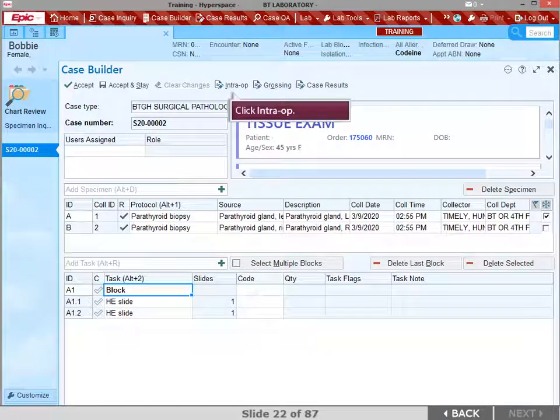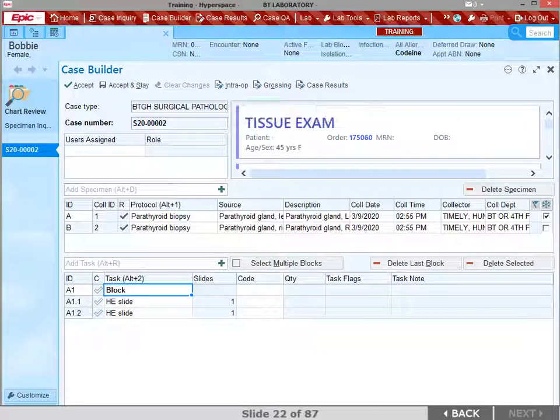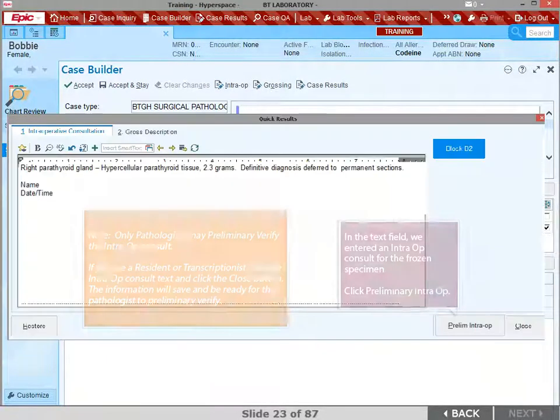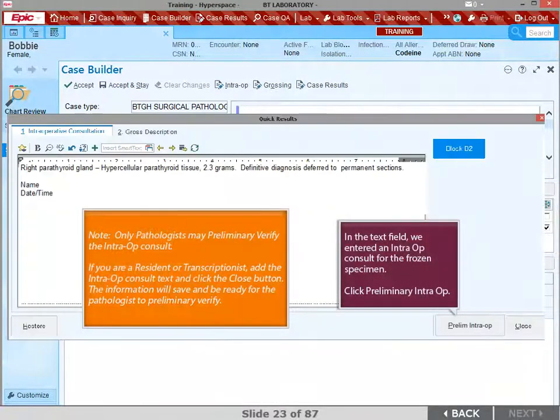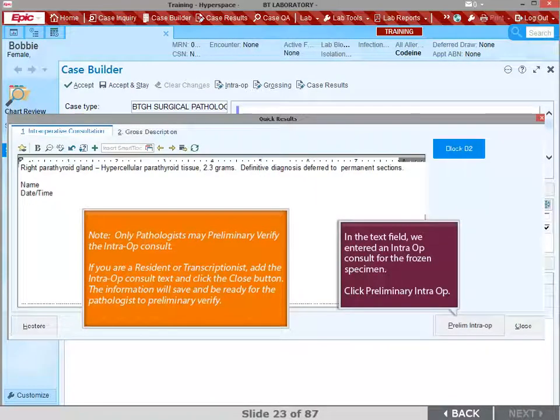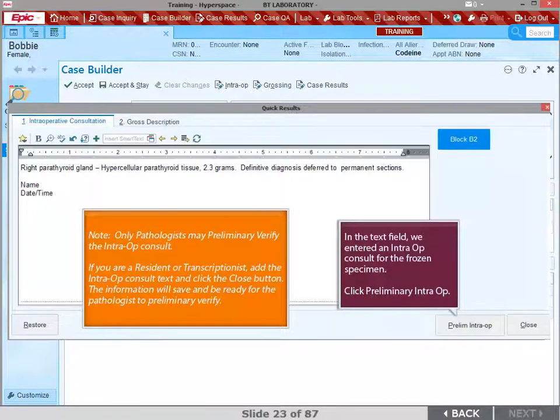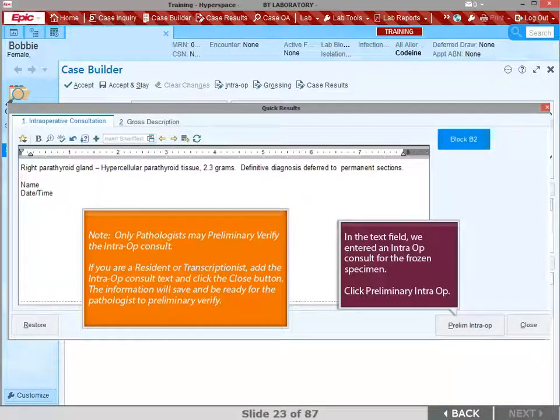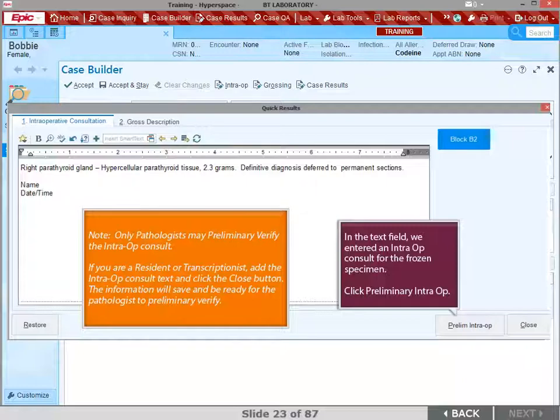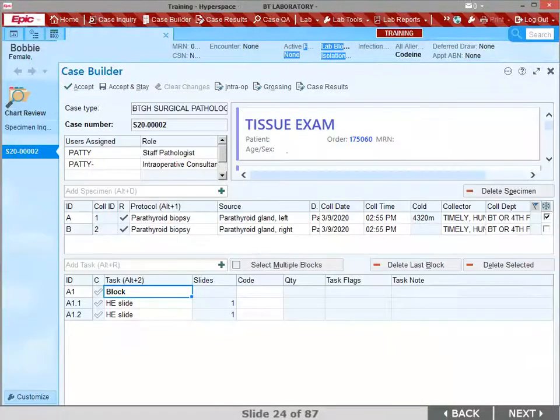Click IntraOp in the Case Builder Toolbar to add an intraoperative consultation. In the text field, the IntraOp consult for the frozen specimen was entered. Note, only pathologists may preliminary verify the IntraOp consult. If you are a resident or transcriptionist, add the IntraOp consult text and click the Close button. The information will save and be ready for the pathologist to preliminary verify. Click the Preliminary IntraOp button.